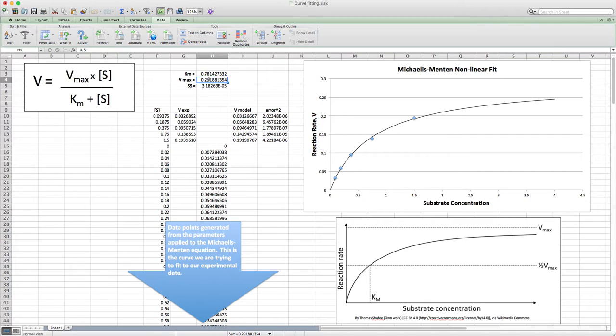That's pretty accurate. First of all, the data is unbelievable to me, considering the primitiveness of the technique we're using. But if you're really careful, it's pretty precise, and it really does a great job of fitting the theoretical model of enzyme kinetics. So this is the model, this is our data, we fit it using these parameters, and if we look these parameters up for the activity of catalase, you'd see that they match up pretty well. But this is how we could actually compare, say, catalase from carrot versus catalase from potato versus catalase from yeast.